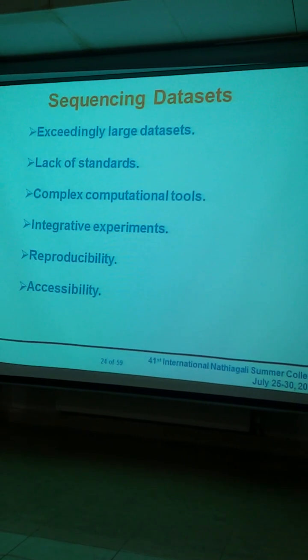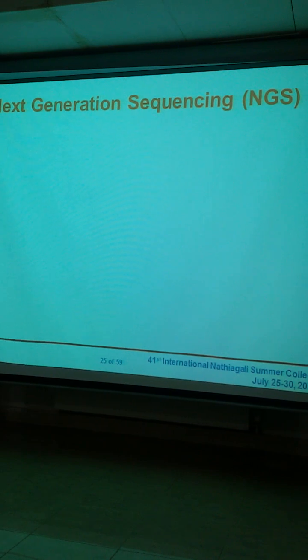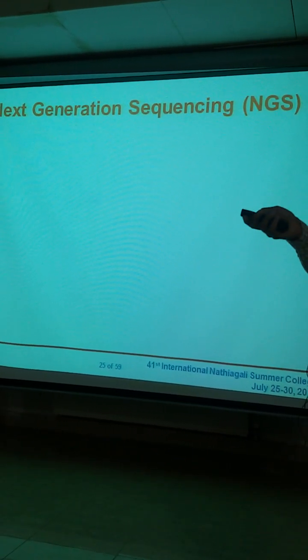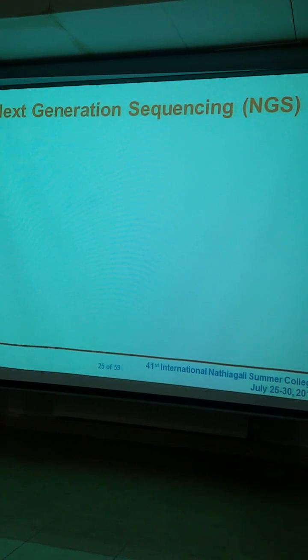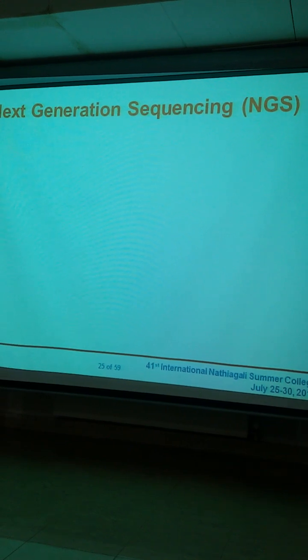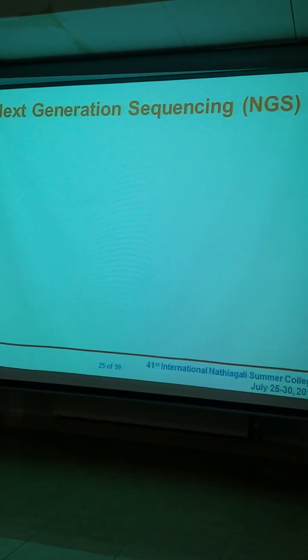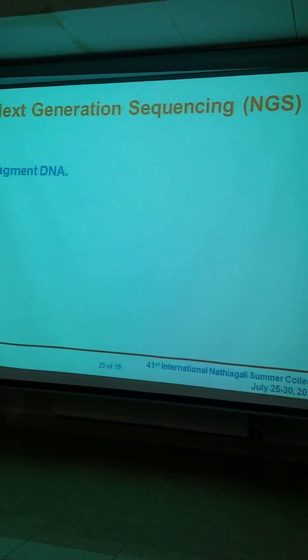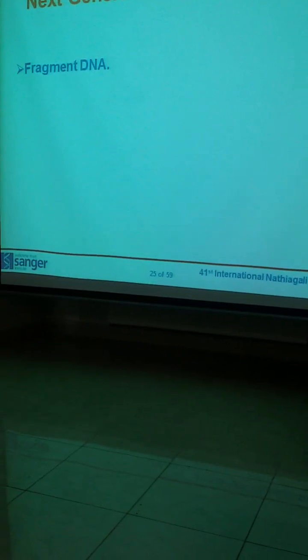And currently the Sanger storage has about 25 petabytes, which is one of the largest in life sciences. And in the next 2 years it's going to increase to 80 petabytes, which will probably be one of the largest in the world after CERN for physics databases. So for all next generation sequencing, there are just 4 steps.